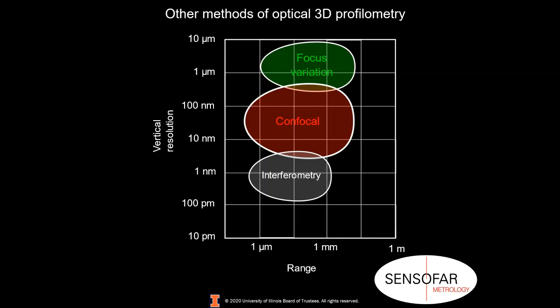Sorry, I got distracted thinking about how cool it is to see through samples. What was the rest of the question? It was ellipsometry versus X-ray reflectivity versus these techniques for surface roughness measurements. Like how small of a... How do they compare? Yeah.